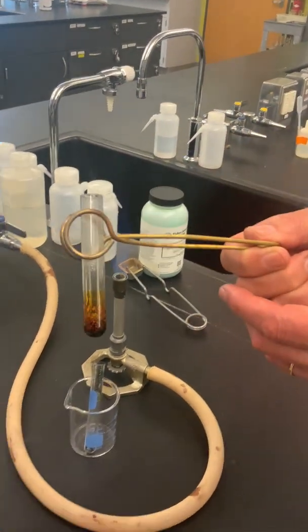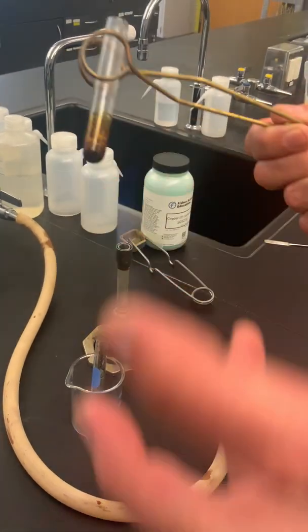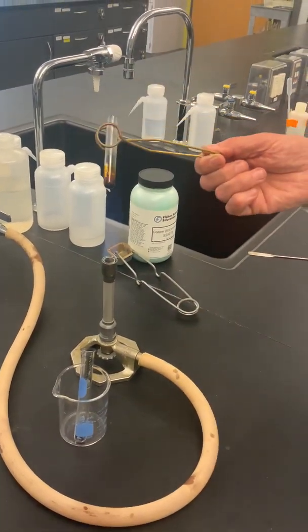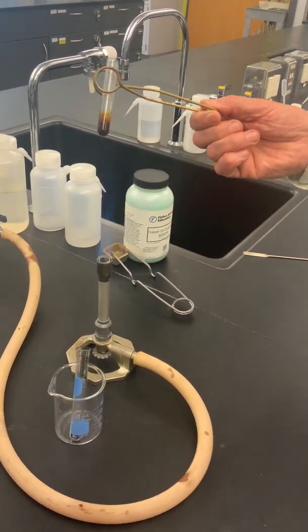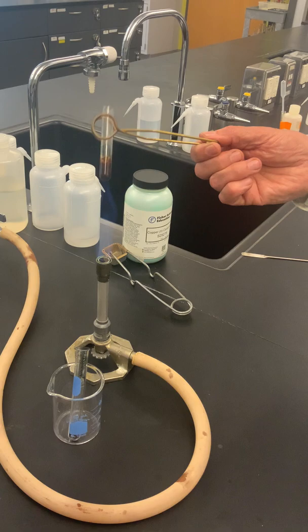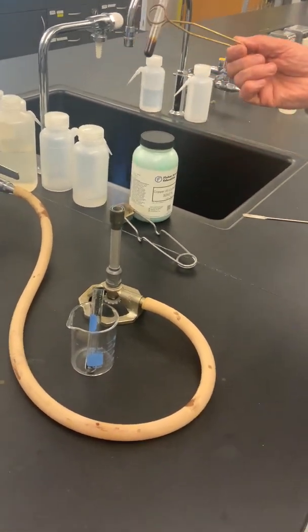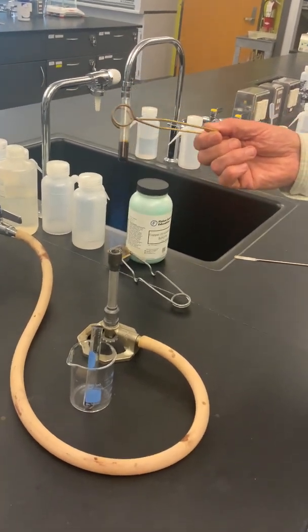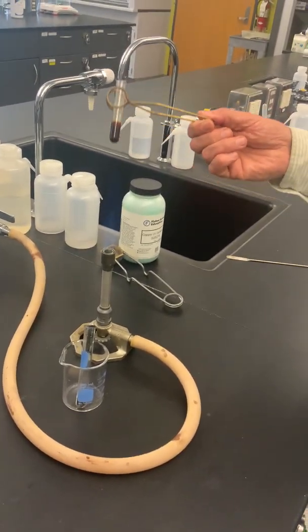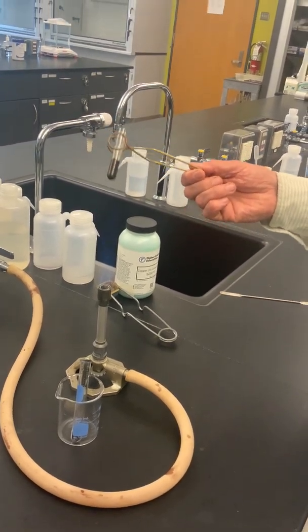If you look carefully at that test tube, you can see up near the top condensation of water, suggesting strongly that water is indeed one of the products of this chemical reaction. Kind of smells like burnt marshmallows. Yeah, and it probably is the result of me burning some of that sugar, but we are accomplishing, in general, the transformation that we want.